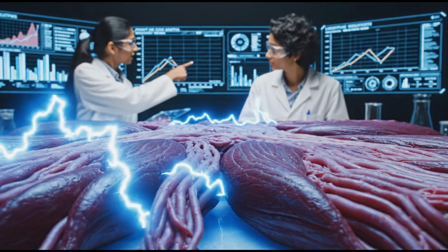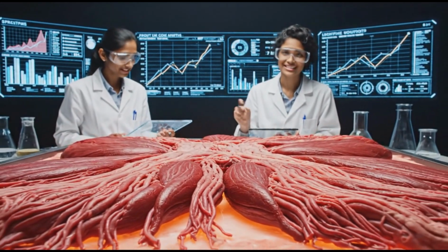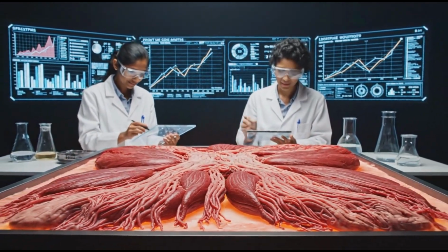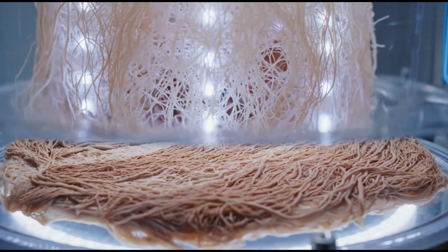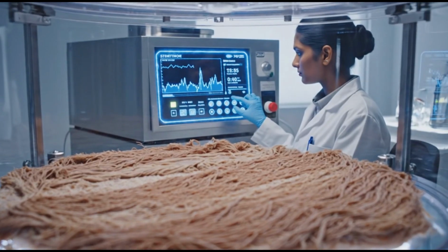The maturation rate has increased by 20%. And the structural integrity is holding steady. Excellent results. Stimulation intensity adjusted through digital controls. Tissue adapts without structural damage.